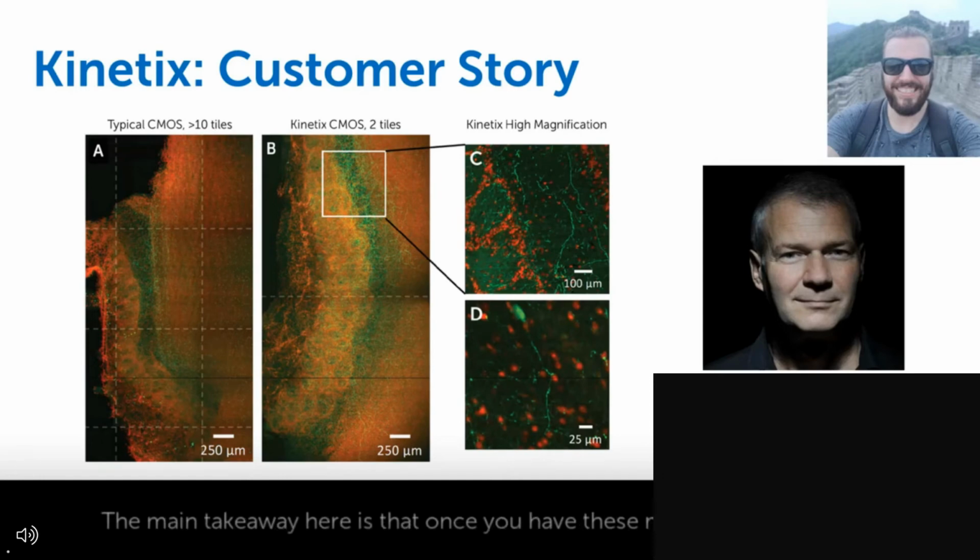The main takeaway here is that once you have these much larger samples, thanks to the expansion process, you now need to make sure your imaging field is sufficiently large so you're not constantly stitching and tiling different images together and adding lots of time onto your experimentation.